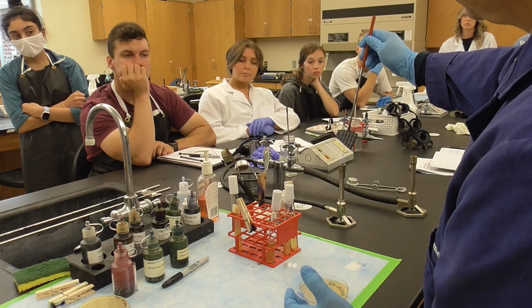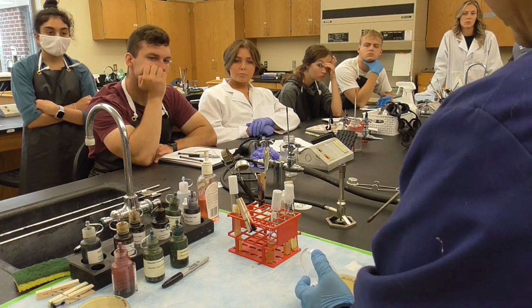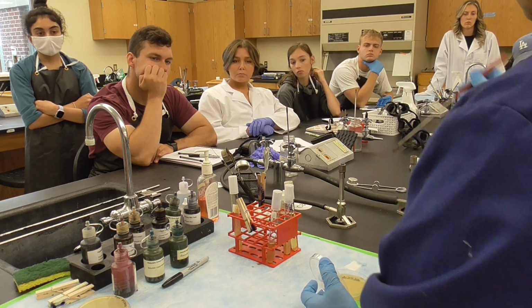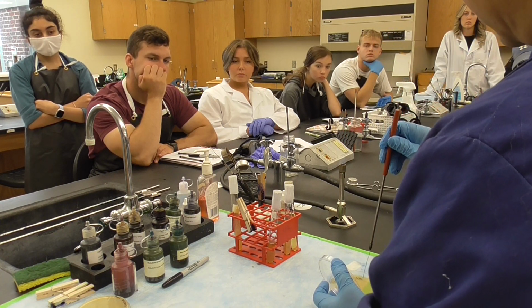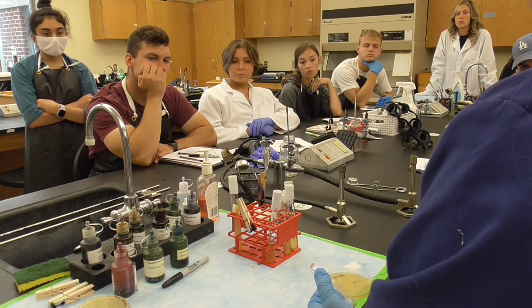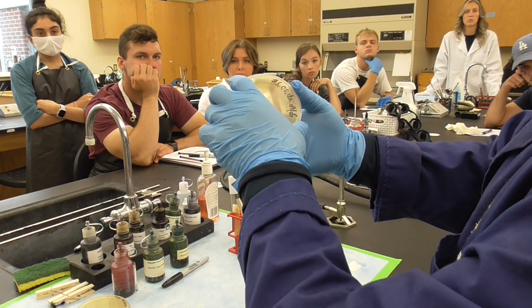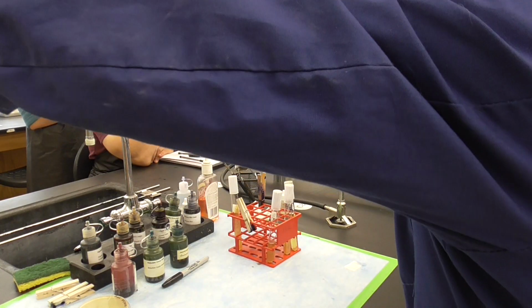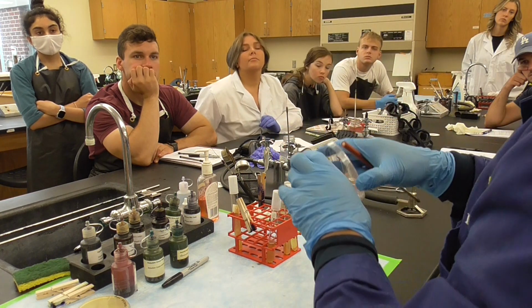Flame the loop. On the side you cool down. From the side of the second streak you do a third streak. Then flame the loop again. Cool down. From the side of the last streak you do a last one. And you can see when you finish, there is a mark there. If you come here to see, or if you go this way, you can see there is a mark there. And you know you put the bacteria there already.